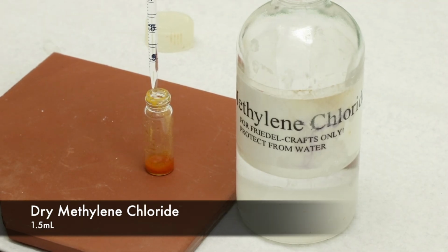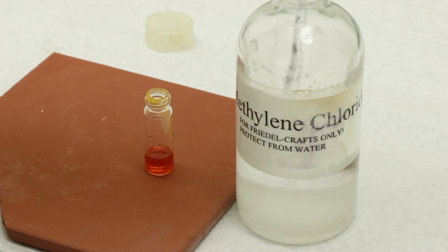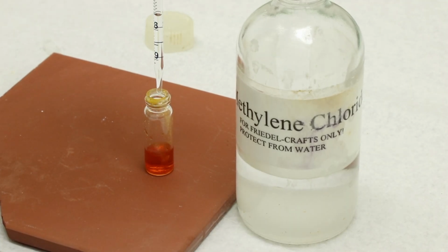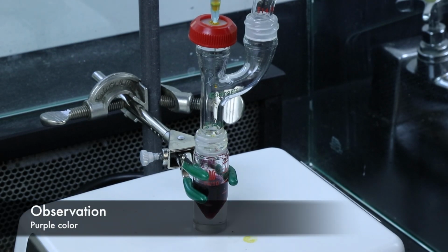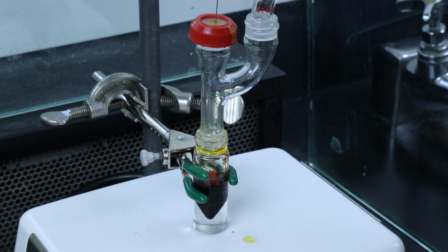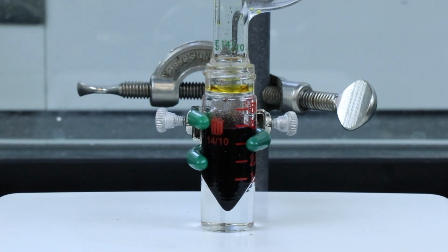Once the ferrocene is fully dissolved, I'll be adding it to the conical vial using a needle and syringe again, and this is where I'm expecting to see a purple color once it's added. So that looks great. This means that I don't have to start the reaction over, so that's nice. And now we can just let that react at room temperature for about 15 to 20 minutes.